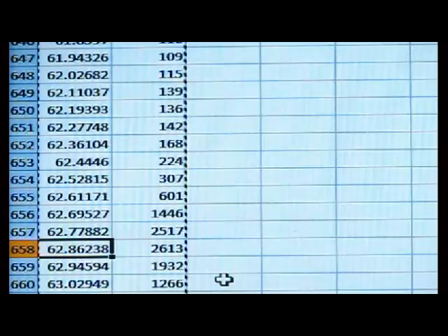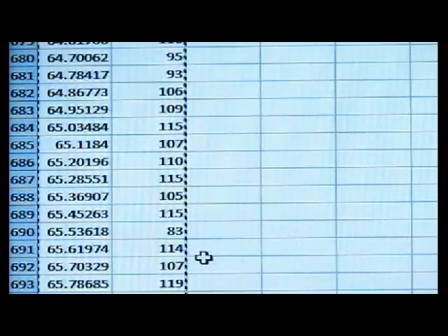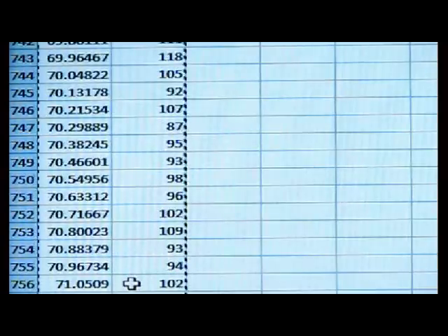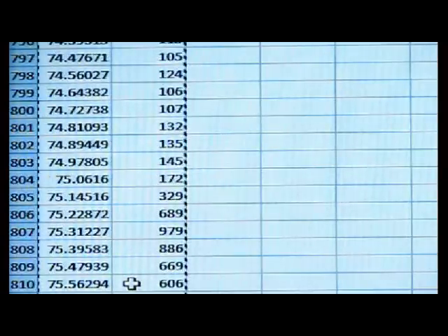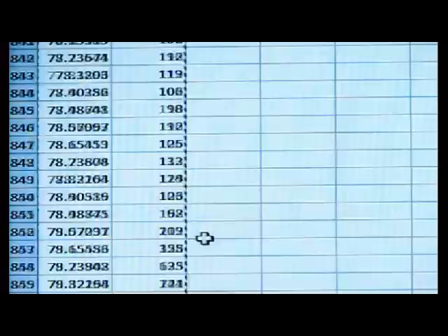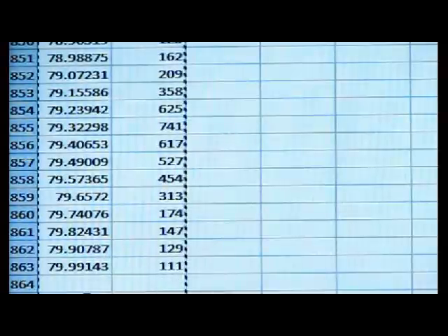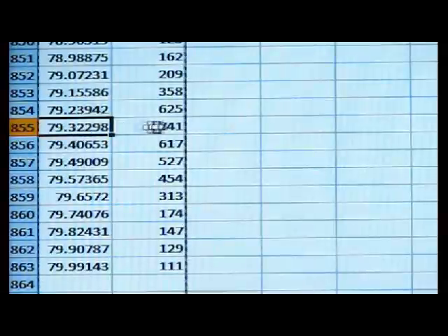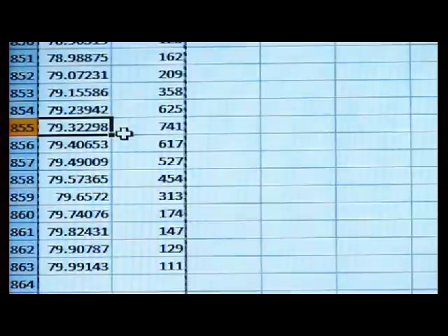Now the fourth one we earlier noted as 75.37 and compare it with the given data. That is 75.31227. It has the maximum intensity 979. Now the last one, that is 79.36. Here, 79.32298 got the maximum intensity 741. So it is identified as the last peak.